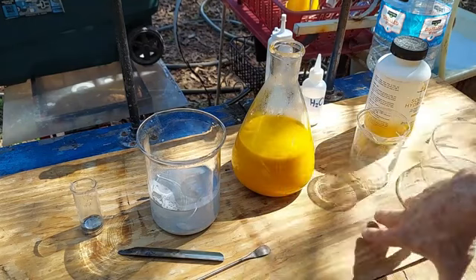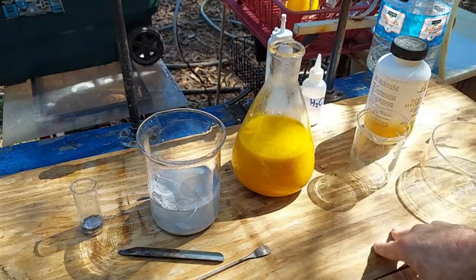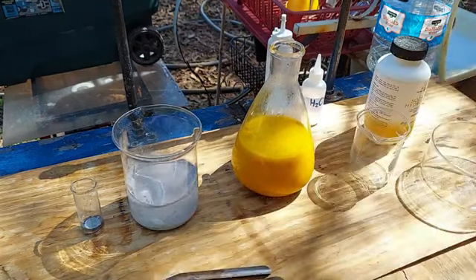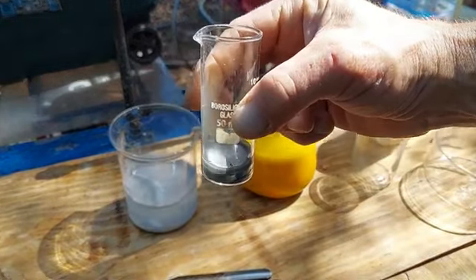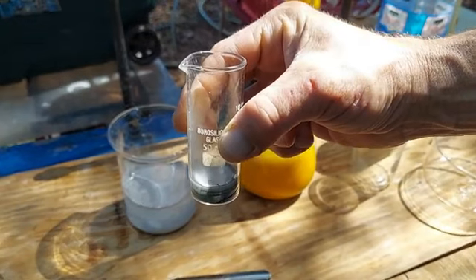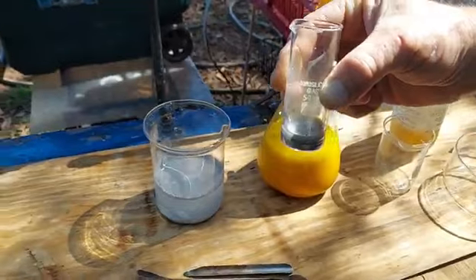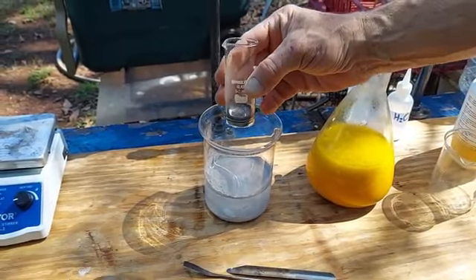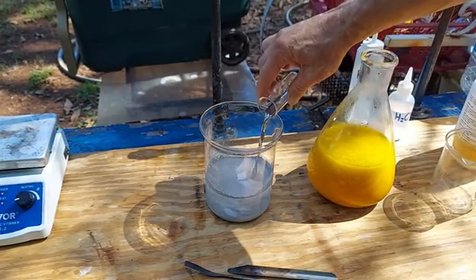So, although we've been able to drop out any mercury that's left in solution here as the oxide, I want to continue to experiment with this a little bit and see what I can do. Now, this is mercury that I have had sitting in a flask for the last 4 years. I can't even remember exactly where I got it from. It was dirty mercury that somebody sent to me, and I just have never gotten around to doing anything with it. I want to add it to this and see what it does.